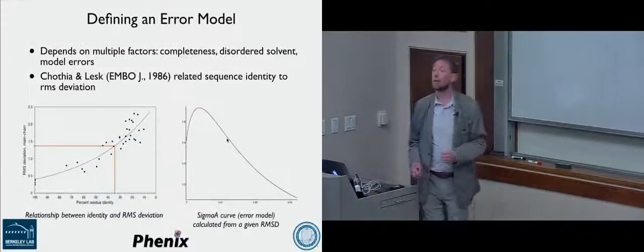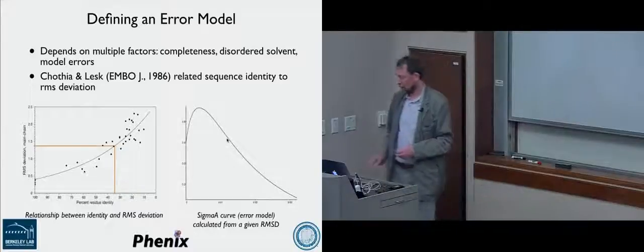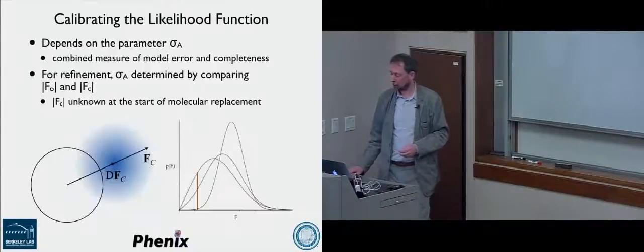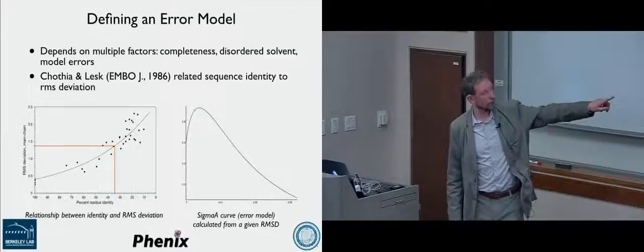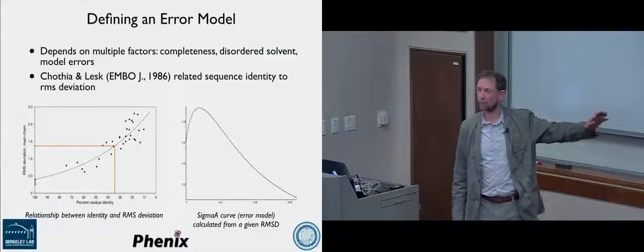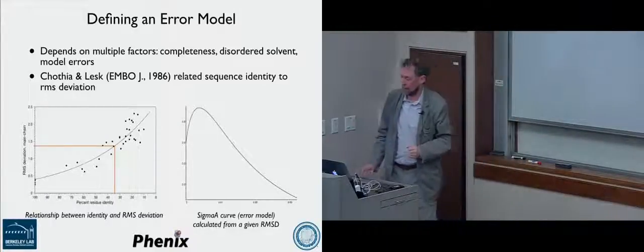So in practice, sorry, that also depends on the resolution. That is, at low resolution, that boomerang must almost always be smaller. Yeah. So I didn't show you that on that slide, but it kind of is shown here. This is the distribution of sigma A with resolution. So you can see at low resolution, you have, as you say, essentially more narrow, more confidence, effectively.